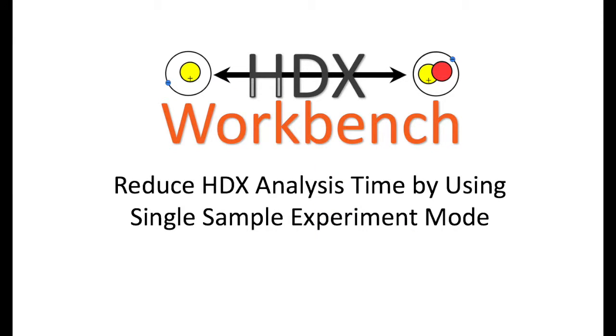In this video, we will show how to speed up HDX analysis by using single sample experiment mode. Conventional experiments in HDX, such as a protein with many ligand-bound states, would require reanalysis of the apo state. Here, we will show how to analyze everything as individual sample experiments, create any comparison, view the results using multiple tools, and additional automation features will be shown.